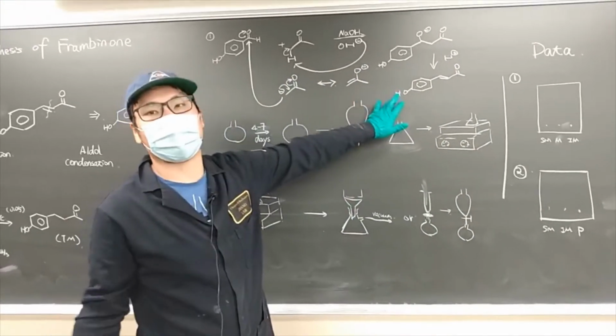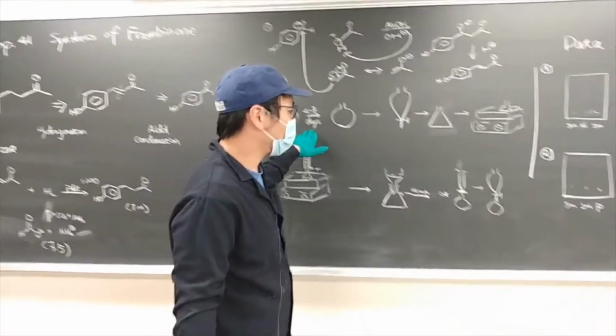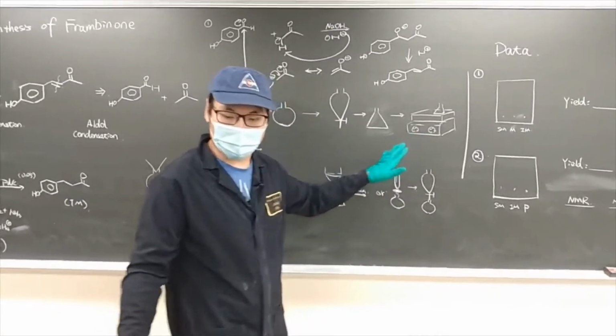That will be the intermediate of the first step.